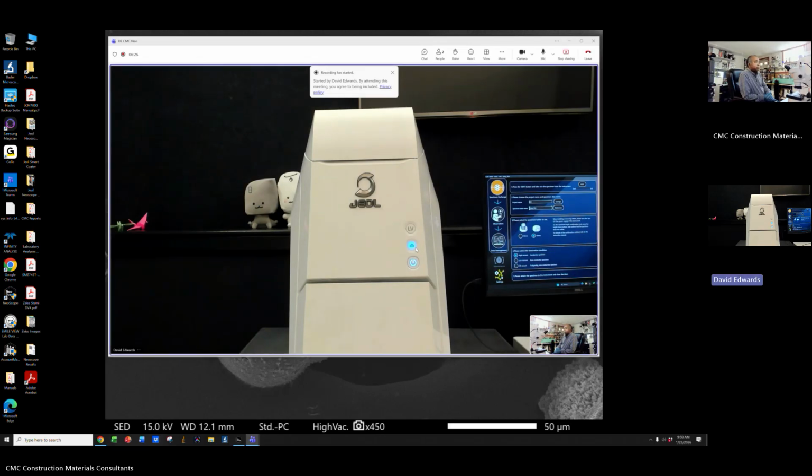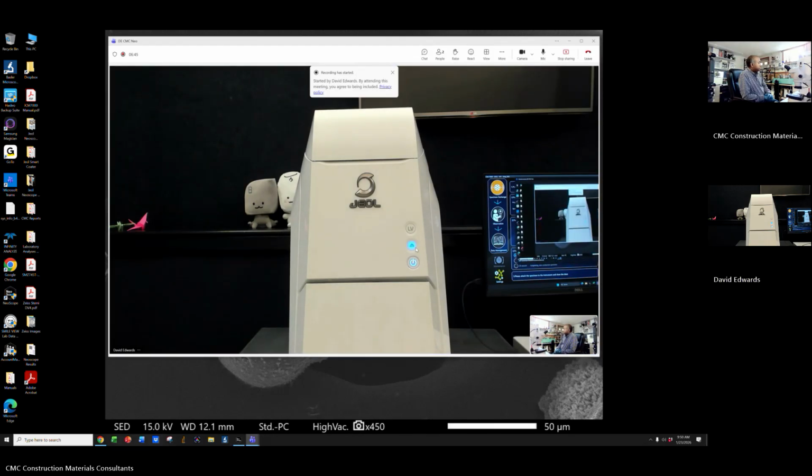And let's see. There we go. Okay, so now you want to open all the way out, right? Yeah, all the way out. Yep. That shouldn't have tripped the camera.